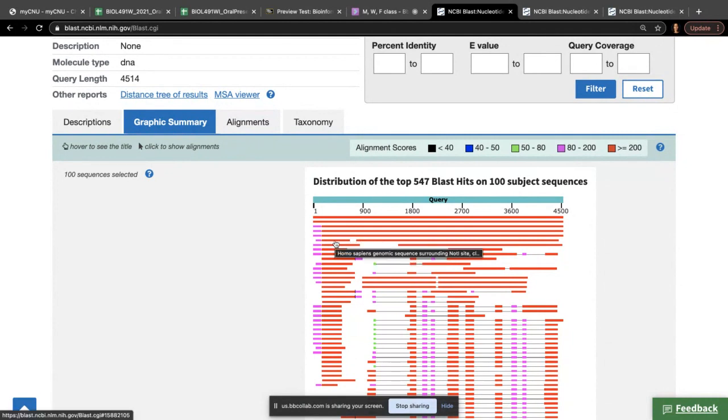This one is, let's see, no, this is genomic, then I cannot say that that's a gene. When it says genomic, it's just some sequence that matches that. And I'm like, okay, I don't want genomic. I only want the stuff that matches mRNA, because then I know that whatever part of this sequence is transcribed, there will be a match. Then I'll go like, okay, then let's look at mRNA only.